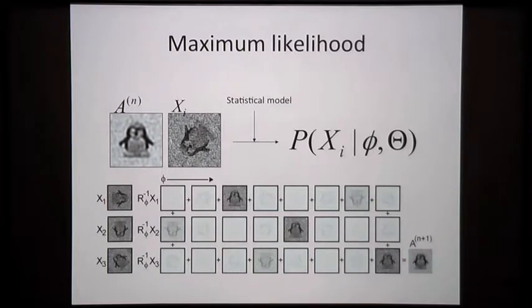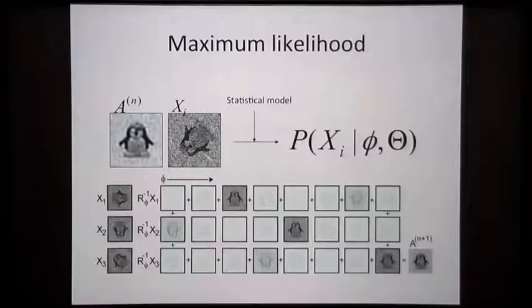The average image for our next iteration, because it's a similarly iterative process, is that not just every image goes in one orientation, but every image goes in with all the orientations. These are normalized so that every image in total goes in with a total weight of 1. So that's the main difference between these maximum likelihood approaches and the maximum cross-correlation approach.